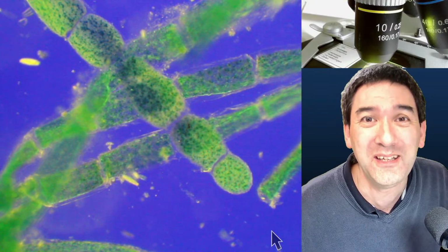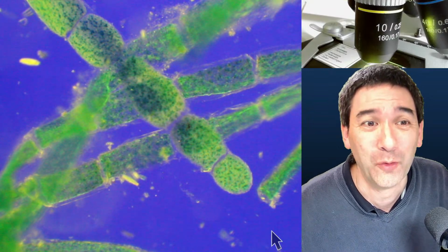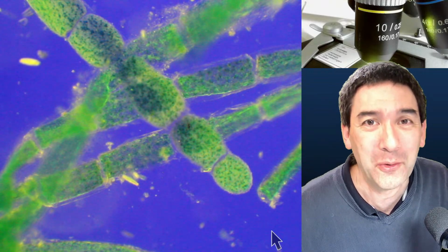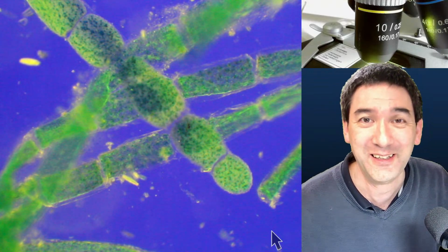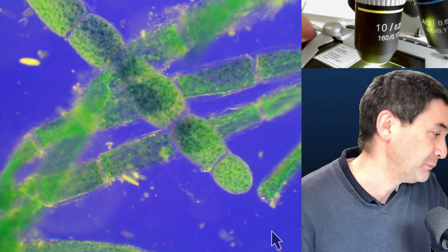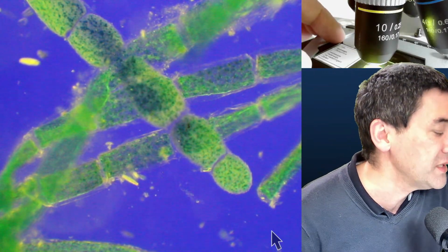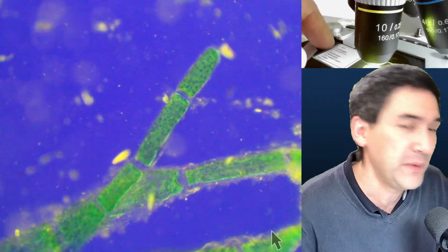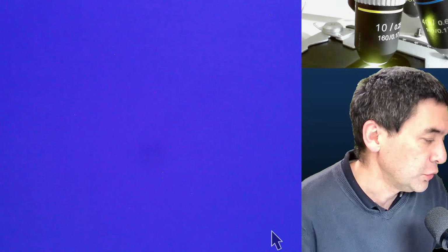I bought some antique slides, and honestly, they were probably even better than some of the modern ones you're able to buy. They were really nice. If properly made, there is no reason for them to degrade, but it really depends on how much time was taken to properly prepare them and to properly dehydrate.